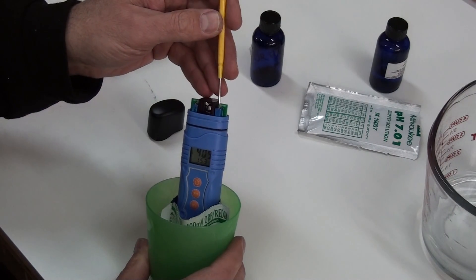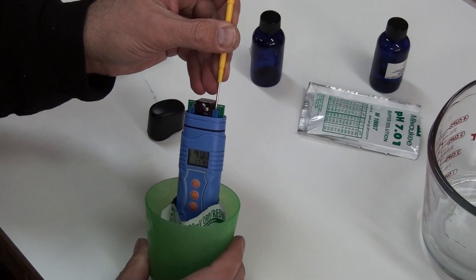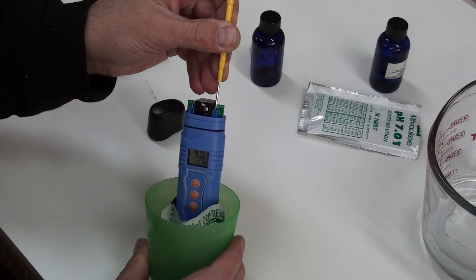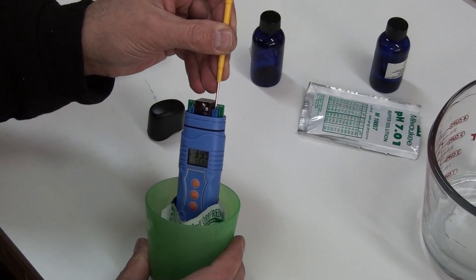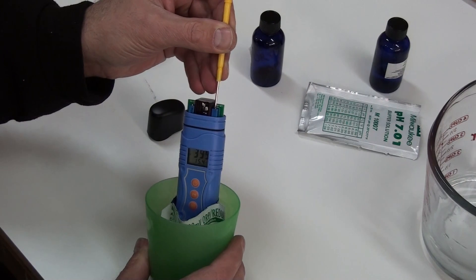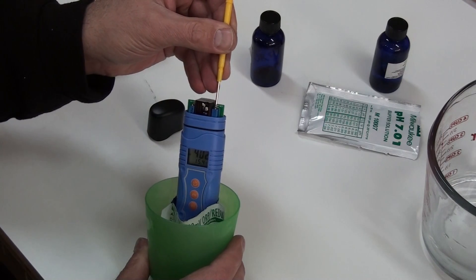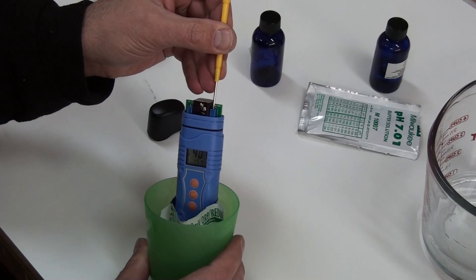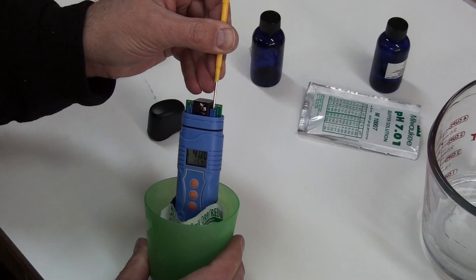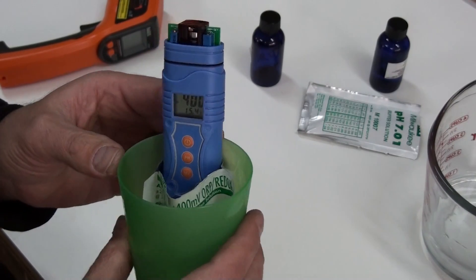We'll turn this down to 400 millivolts. Hold this. Let it settle down. Okay, we've got 400 right there and that's considered calibrated.